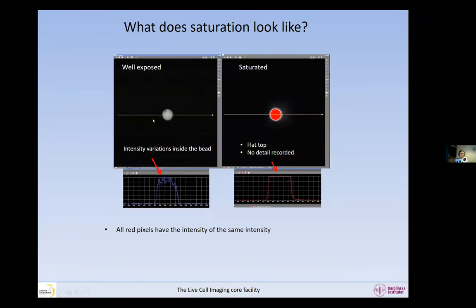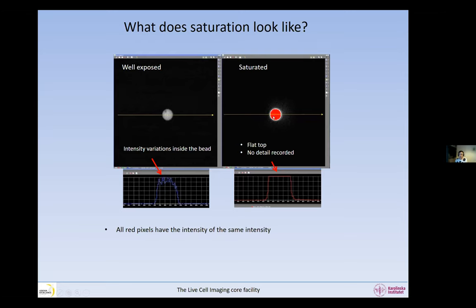If I look at two images of a fluorescent bead — one well exposed, one saturated — and I draw a line across to look at the intensity profile, I can see there is texture in the bead; it's not uniform. But if I look at the saturated image, the top is completely flat and there is absolutely no detail recorded inside the bead. No texture at all. All the red pixels have the same intensity.